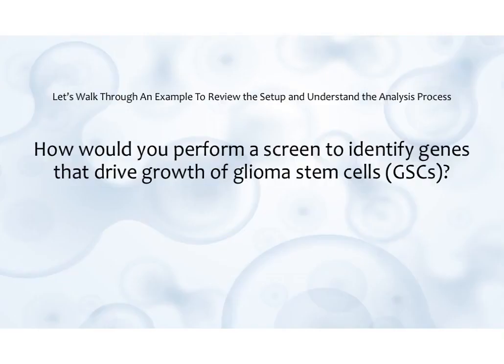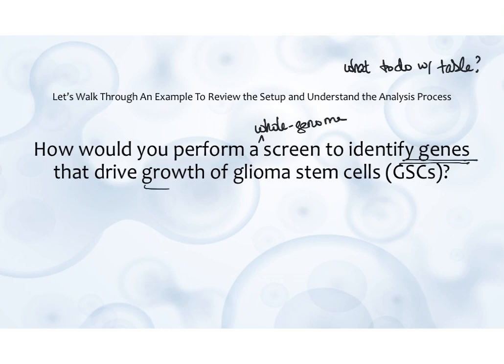All right, so to better understand the setup and this analysis process, like basically we're trying to understand what we are doing with this table. To understand that better, let's walk through an example. So let's say that we want to perform a CRISPR screen. This is going to be a whole genome CRISPR screen to understand which genes drive growth of glioma stem cells.